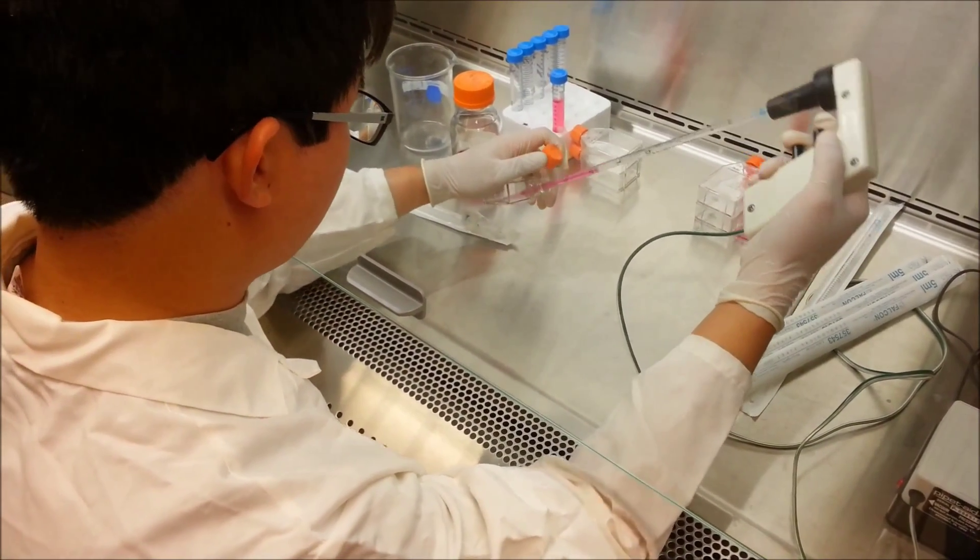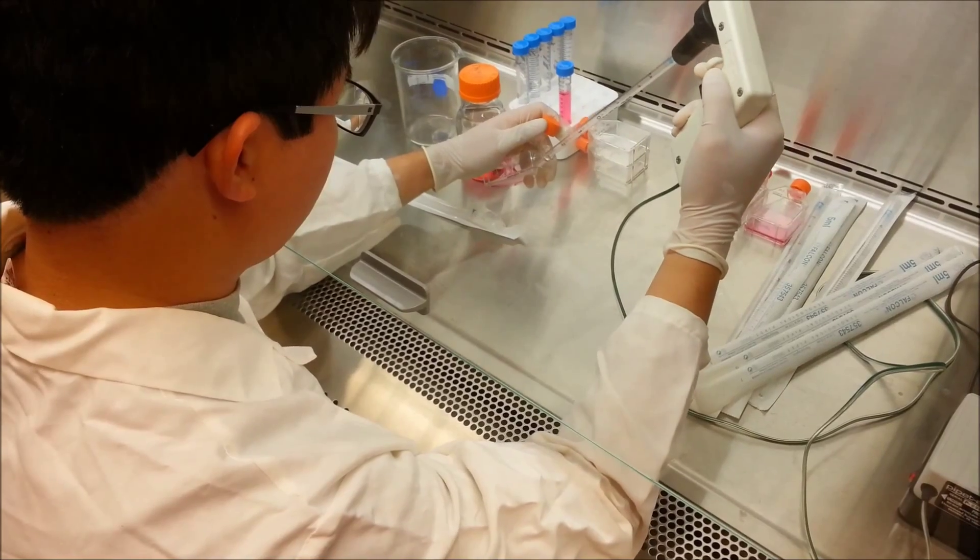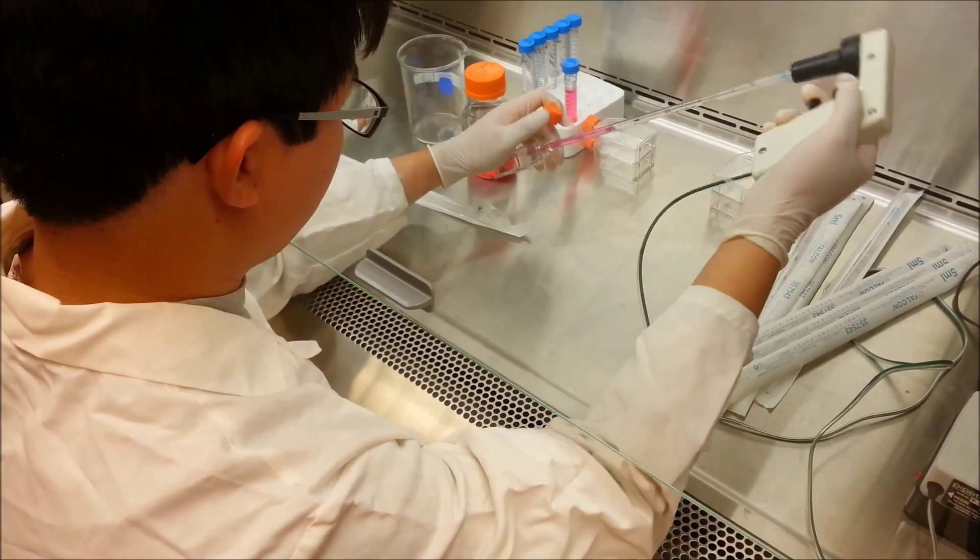Next, using a 5 mL serological pipette, take up the cells and wash the wall of the flasks where they were growing.